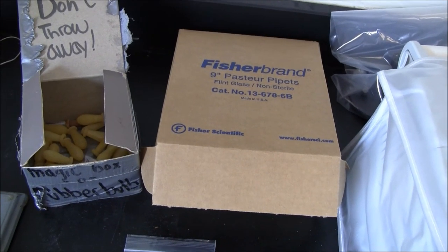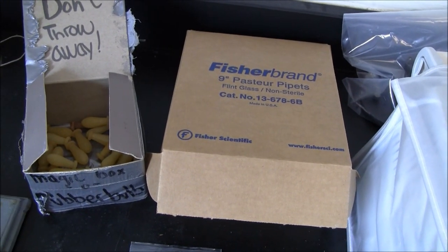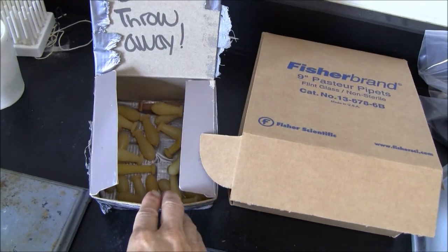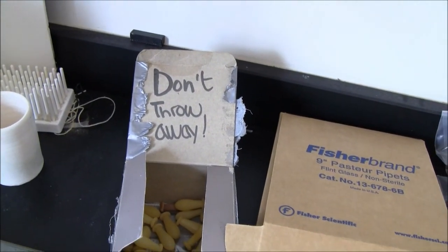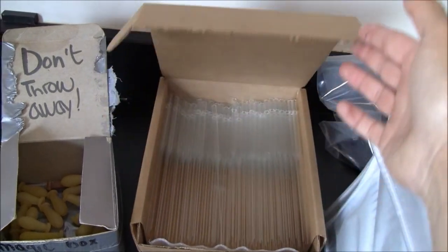Pasteur pipettes are named after Louis Pasteur, the famous French chemist. Two parts. One is glass, one is a rubber bulb. The rubber bulb may be used hundreds of times. The glass parts are typically used only once.